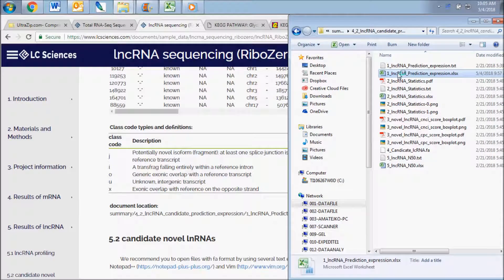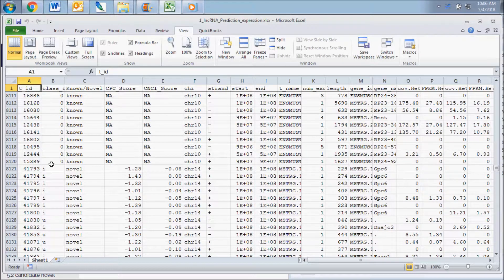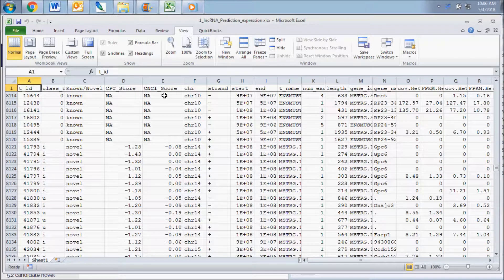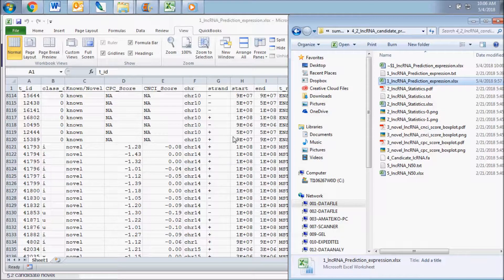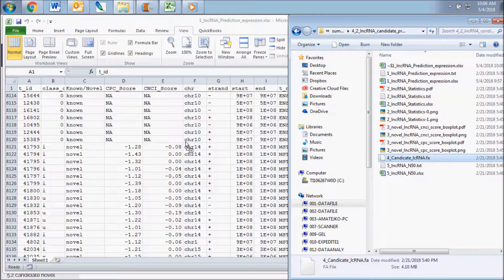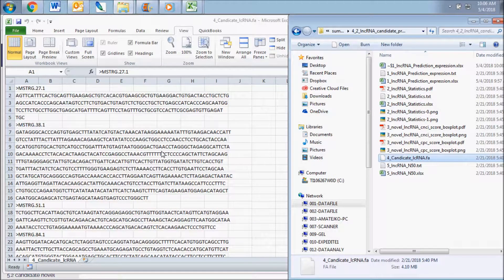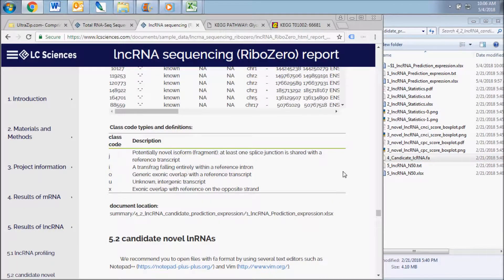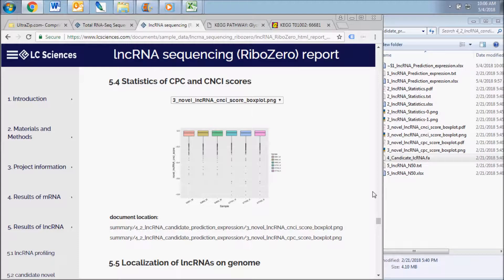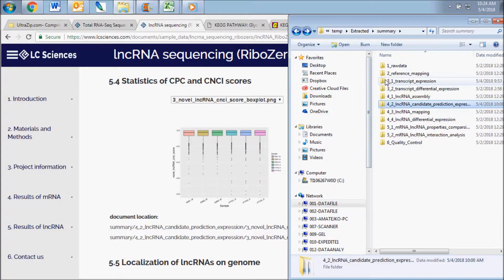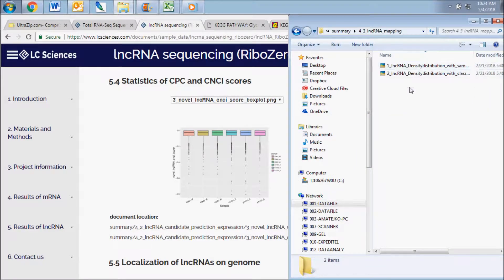You will see that the chart includes data for both known non-coding genes and potentially novel transcripts. The unknown transcripts are each given a CPC and CNCI score. These refer to coding potential calculator and coding non-coding index score, which are used to classify a transcript as protein coding or non-coding. The candidate long non-coding RNAs are listed in the candidate long non-coding RNA .fa file in the same folder. Below the expression data chart, you can find a graph and box plot illustrating statistical data for the transcript class codes and CPC and CNCI scores. The next long non-coding RNA results subsection displays data contained in the non-coding RNA mapping folder.